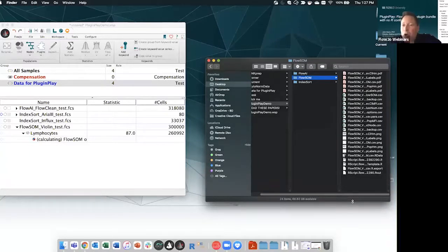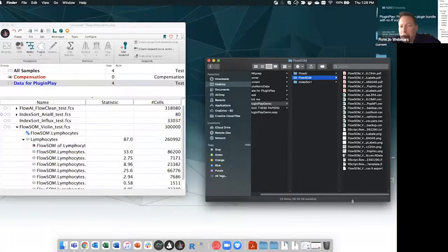All right. Also, I will point out one of the tools in here, one of the heat mapping tools. Probably, if we have to talk about the downsides of FlowSOM, it's that it doesn't automatically figure out the best number of clusters. So I just left it for now as the default 8. I think because of the speed of it, it's easy enough to rerun. A best guess based on how many parameters you fed it is fine. And then we can glance at some of these heat maps to take a better look at that.